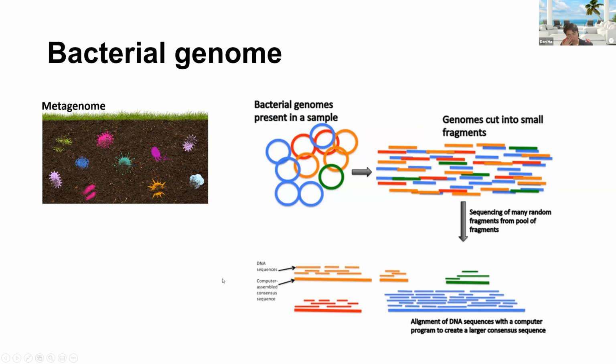But thankfully, with the advancement of shotgun metagenomics pipeline technology, we get to obtain the bacterial genome out of the environmental sample, without any culturing steps. This is for Illumina sequencing. From the environmental samples, you can chop up the DNA into fragments so we can sequence it.